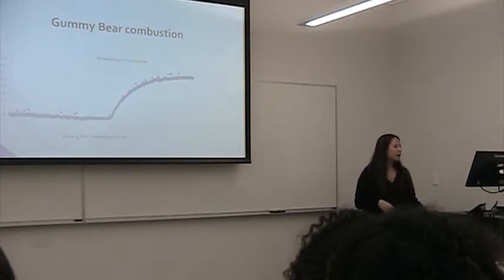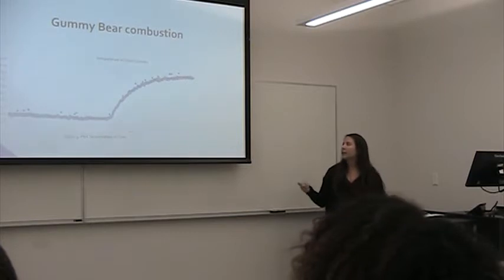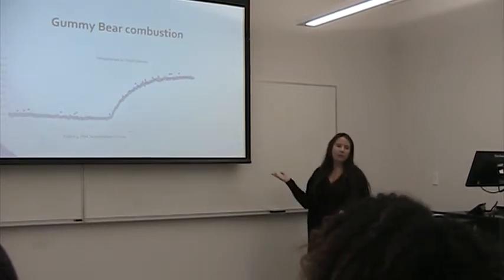And then for the gummy bear, it was almost the same. We waited for 2 minutes. We pressed the button to ignite the fuel in the bomb, and then it became constant again.